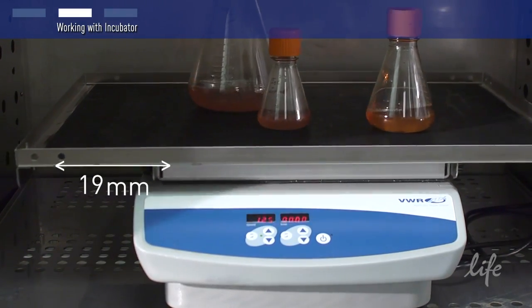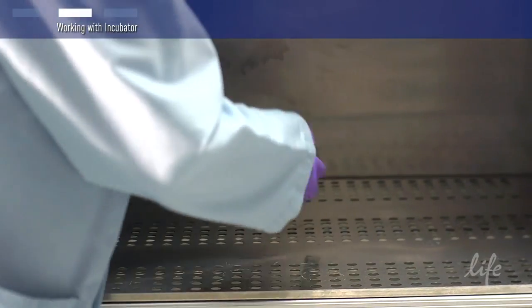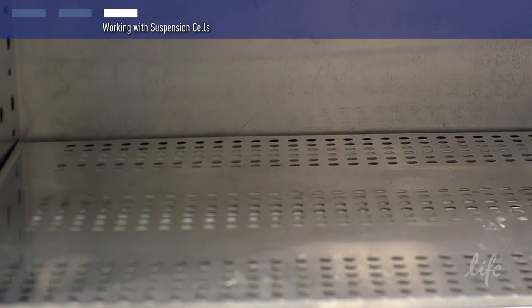If you use a different type of platform, you will need to adjust the speed settings accordingly. Here's a tip: check the dimensions of your incubator before you order a shaker platform, as some platforms are actually too large to fit inside an incubator.